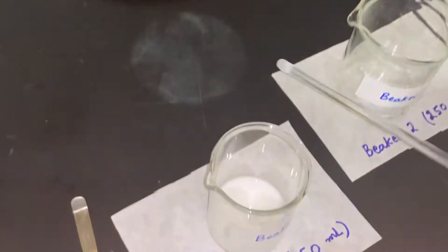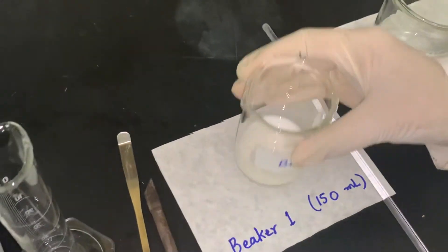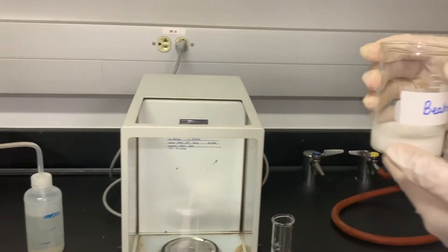After stirring for one or two minutes, I'm going to separate the solid from the liquid. For this, I'm going to do the gravity filtration.